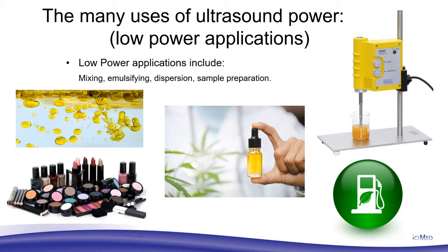So what actually happens? We've seen what happens with a propeller and how that damages and how it spins off those cavity bubbles. This is a video of an ultrasound probe.